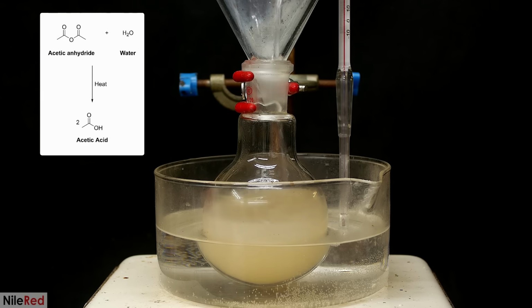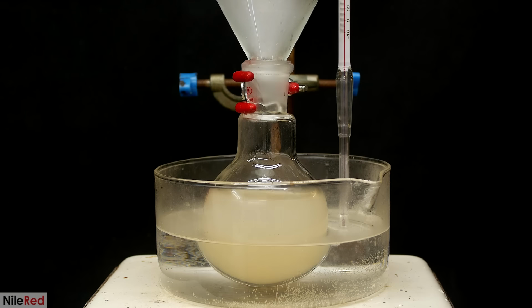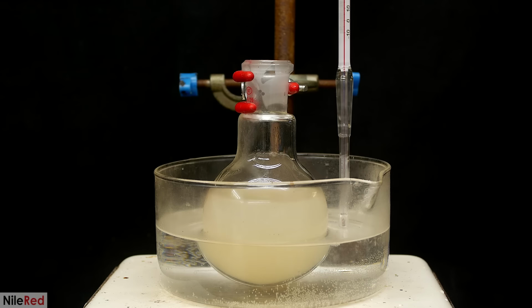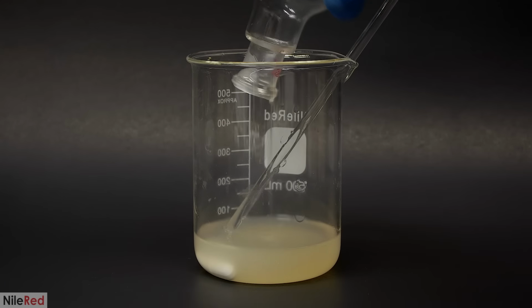The other 20% of this is just water, and up until this point, everything was completely water-free. The purpose of adding it now is to destroy any excess acetic anhydride that remains after the reaction. I can't just add pure water here because it could cause the cellulose triacetate to fall out of solution. If enough falls out, the whole solution could freeze, and this step could get messed up. The extra acetic acid just helps to keep everything dissolved. After the addition, I keep it here for about 15 minutes, and then I pour it all into a beaker.